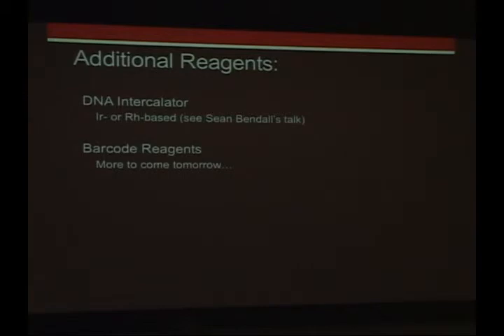One other reagent that I haven't added here, but I should have, that we've started playing around with in the last year. How many people have ever done BrdU labeling on fluorescence? Quite a number of people. So it's a really convenient way to measure cellular proliferation. BrdU, an analog of uridine, gets incorporated into DNA.